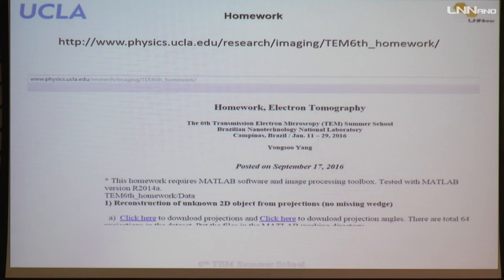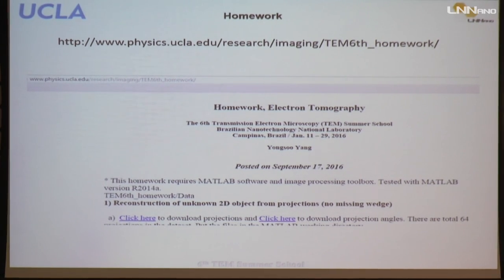I put very simple questions, and I gave very detailed, almost the answer. So I think this will not take more than 30 minutes, and if you're fast, within 15 minutes you can finish everything. If you have time, you can try and feel how tomography works, how back projection works, how EST works. Then tomorrow I will explain more exciting work, and you can understand better what's actually happening.